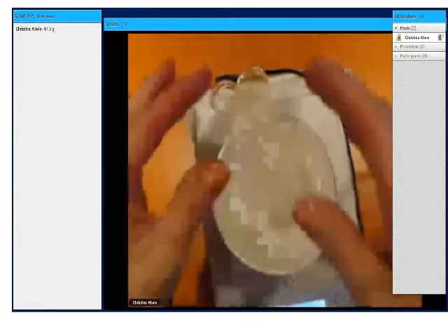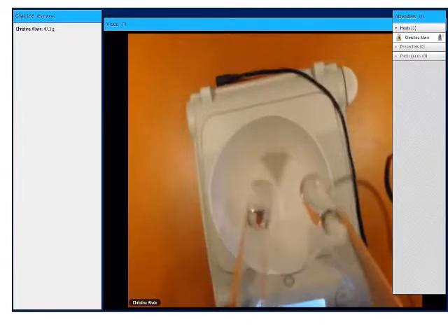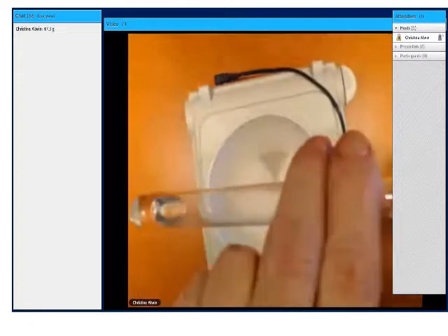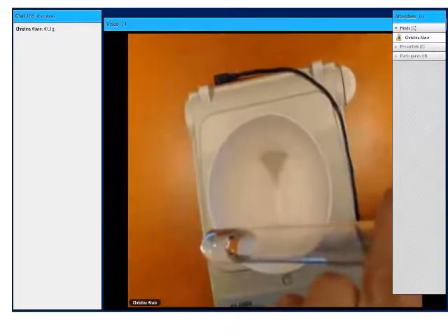Now, what we're going to do is I'm going to show you a chemical reaction. On top of demonstrating the law of conservation of mass, we're also going to see some of the signs that a chemical change has occurred. The sign you're going to see is the one that people probably forget about the most. So let's go ahead and react these two. I am going to pour one into the other. Remember, they're both clear, and watch what happens in the test tube that you can see.